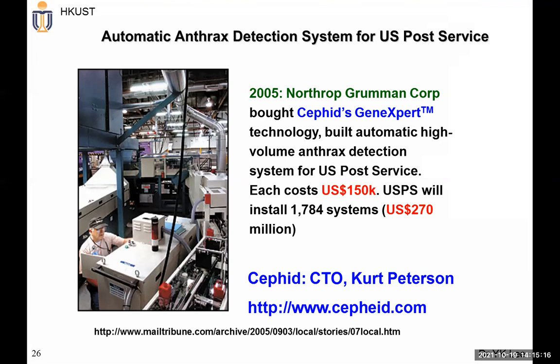But if you make a smaller PCR, what happens? Then you can really reduce the thermal time constant. It'd be faster to do the PCR process, right? So theoretically, it can be much faster compared with a big machine. So that's why this is quite important.